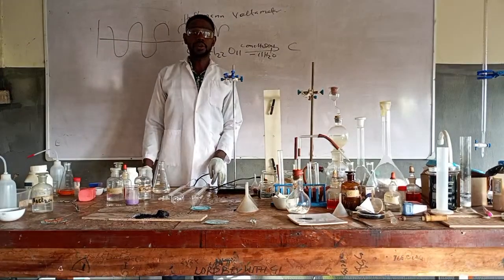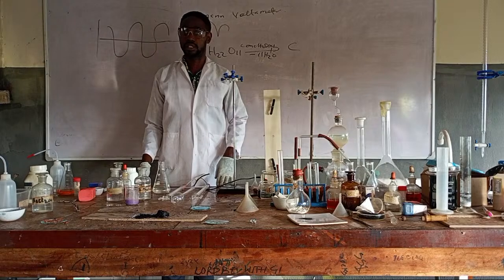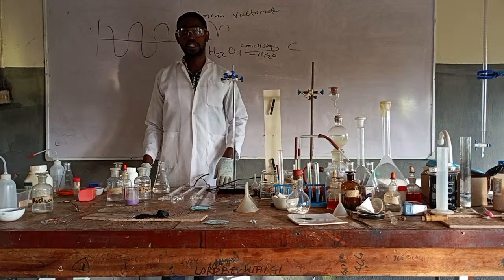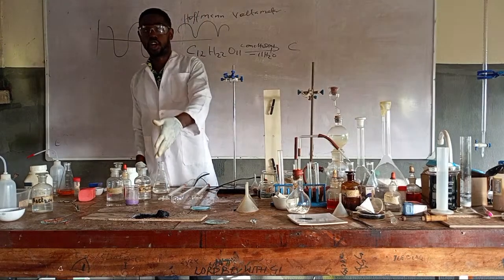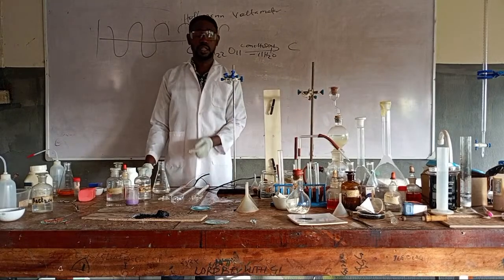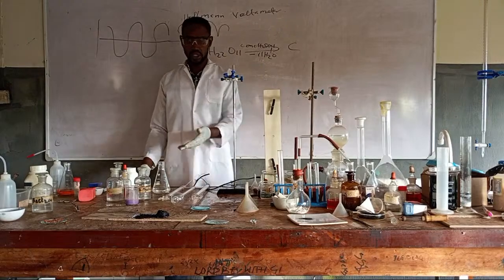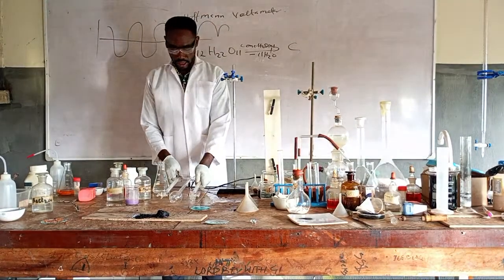So you can now see that the concoction they tell you to take is nothing but sugar charcoal. It has the sour taste because of the unreacted acid. And it is corrosive and irritating because they have not removed some of the acid. So let us fill this thing back.